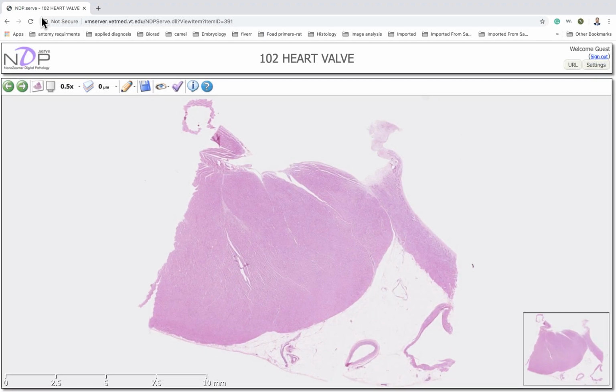So this is a slide of the heart. As I said in the lecture about the heart, it consists of three layers, which are analogous to the layers of the arteries or the vein, which is the tunica intima, media, and adventitia. Instead, in the heart, we call them the endocardium. Then we have the area of the myocardium, and the layer found outside, this is the epicardium.